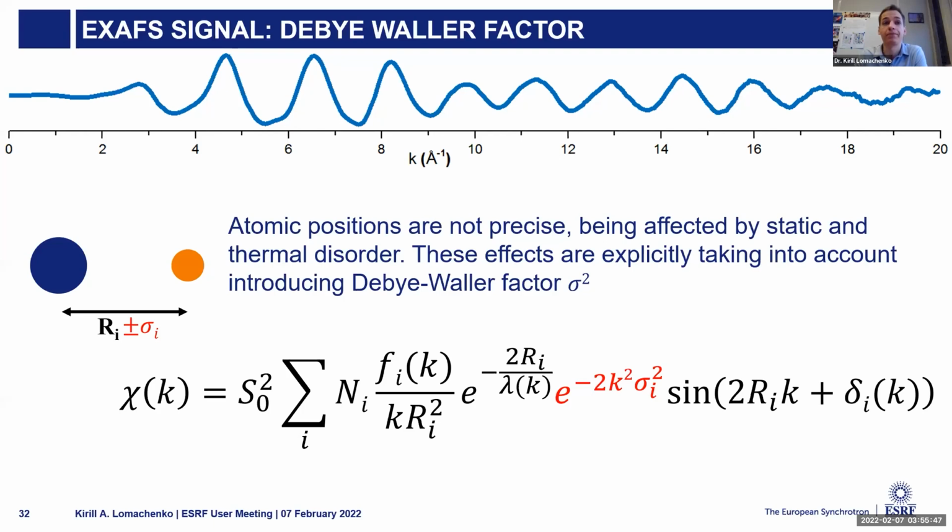And basically that's it. If you're not talking about cumulants, that's what you have. That's the EXAFS equation.